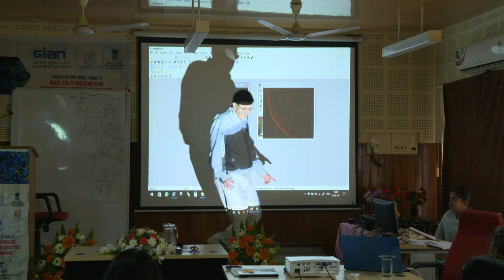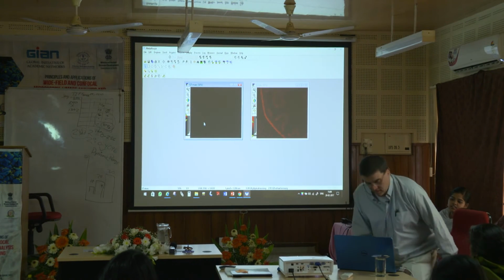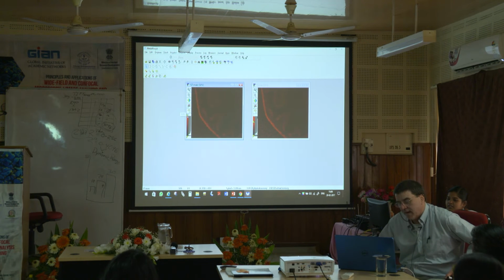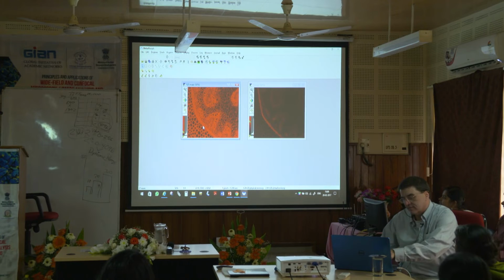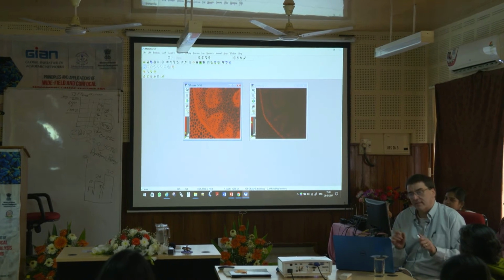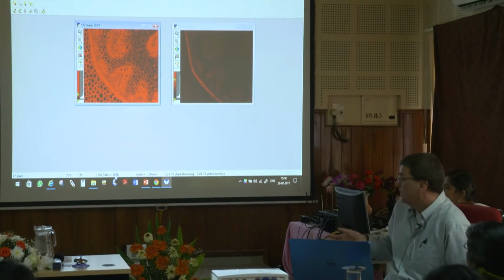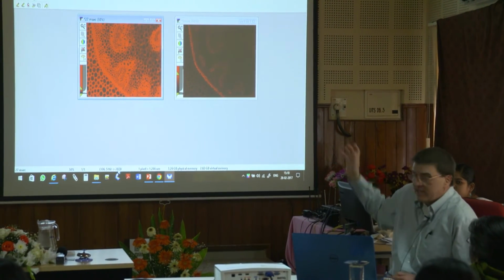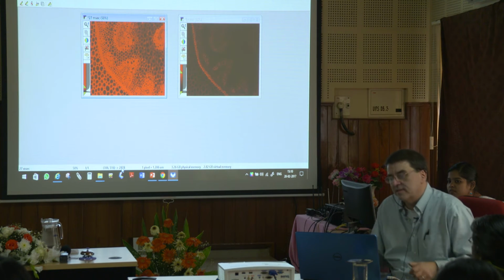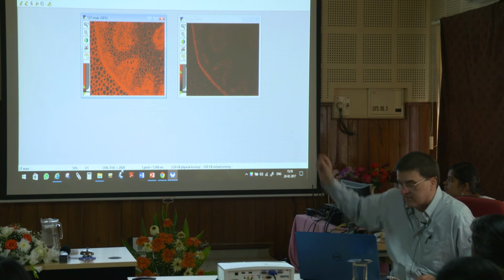So in digital imaging, don't get fooled by how the image looks. Okay? The only thing that matters is the intensity value. It's all about that. That is the data. That's why I had that one slide where I said, this is the most important number on this whole thing. Because in the age of Photoshop and stuff, you can make it look like whatever you want. But the truth is, if I really wanted to compare these truthfully, this is called scaling. I'm playing with that axis.